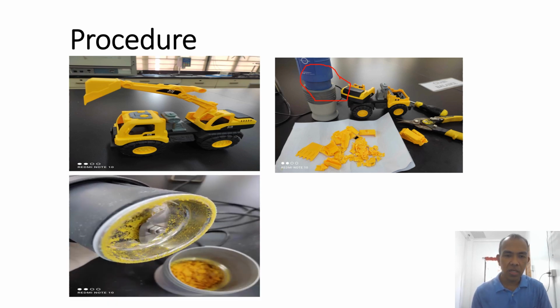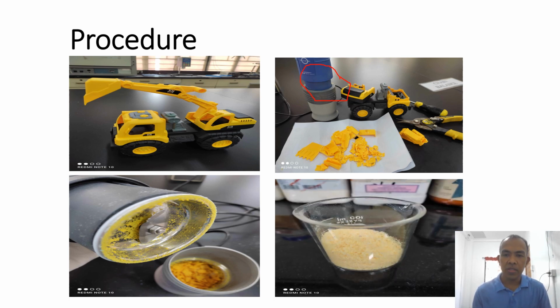And then this is the mill, and may bleach. And then this is the scrape sample, grinded sample. And then this is the finished product. This is the one we will weigh 1 gram with the 0.07 molar HCl. So ganito siya pag pinagtyagaan mo siyang mill.